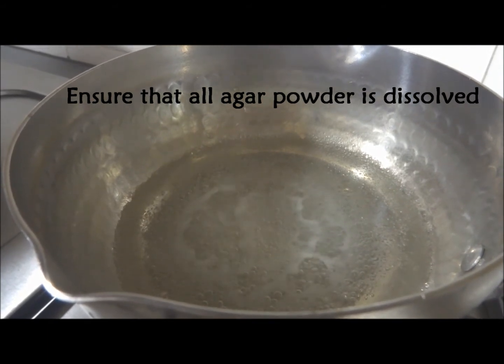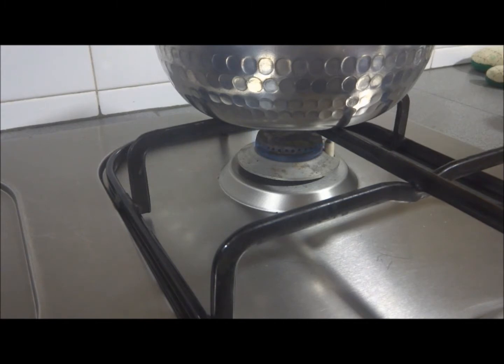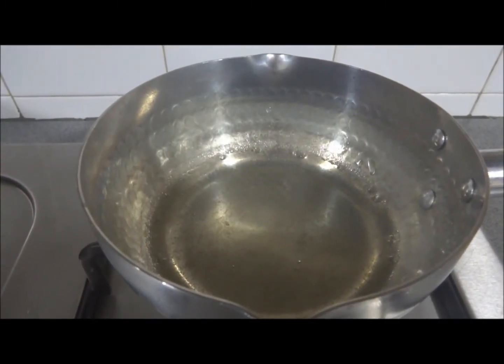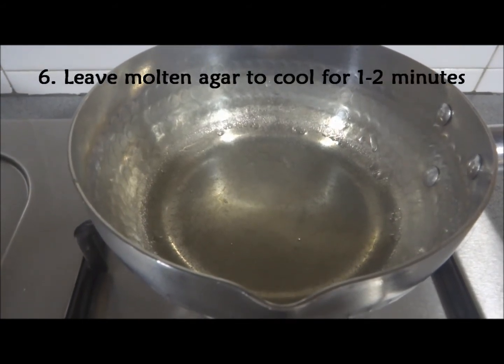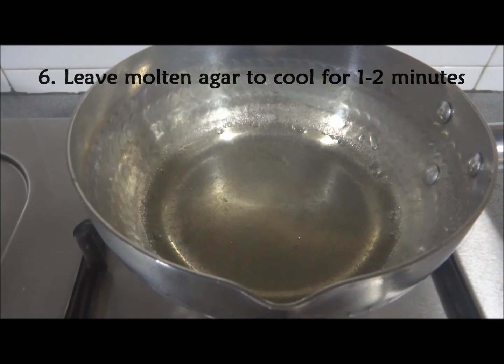When all the agar powder is dissolved, turn off the heat. The molten agar now should have a thick and even consistency. Leave the hot molten agar to cool for 1-2 minutes before pouring it into the petri dishes.